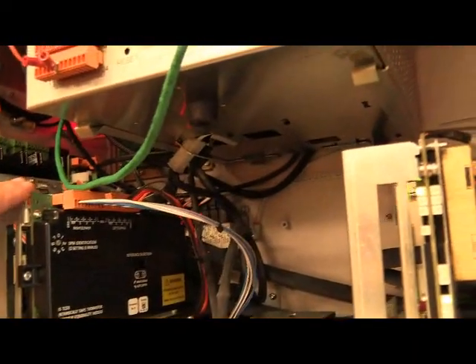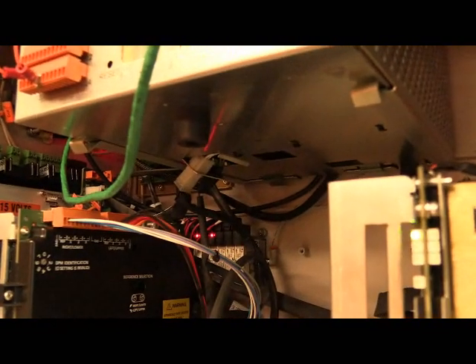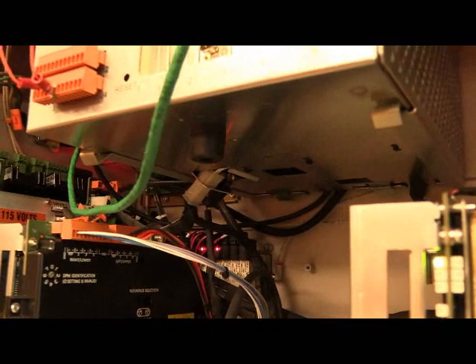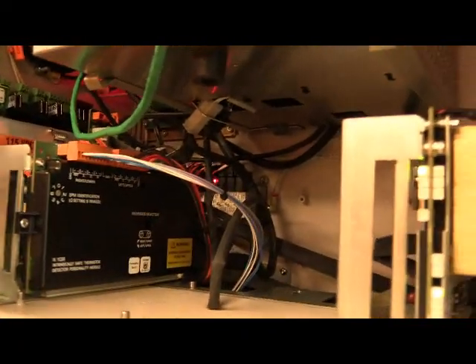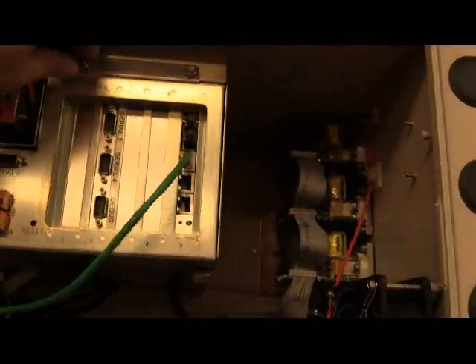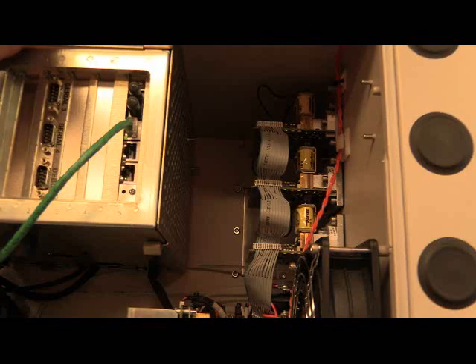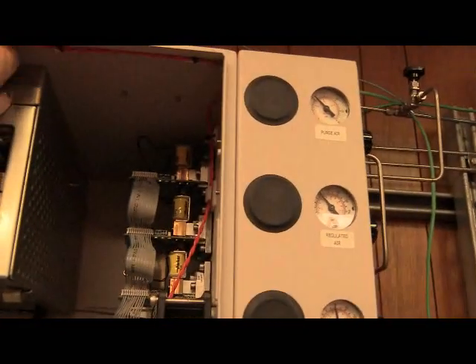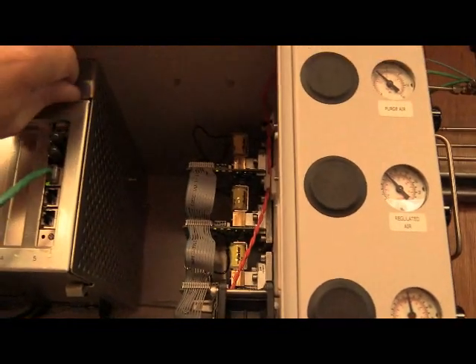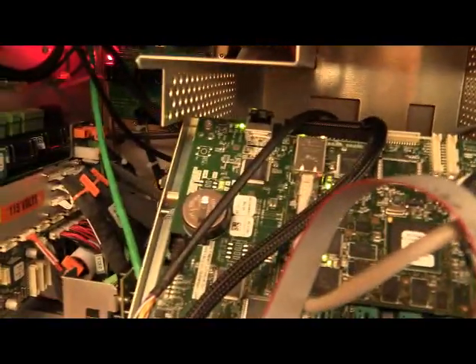Here is your DPM, detector personality module. These wires are coming off of your detector. In this case, it's a TCD, thermal conductivity detector, coming up to the detector personality module, which will interpret your readings and then send them on to the SysCon. SysCon is inside of here. That is your motherboard. It's basically a computer, and we are telling it what readings we are seeing, and then it will do, just like a computer, what we tell it to do with the integration and such like that. Beautiful, beautiful. Battery backup.